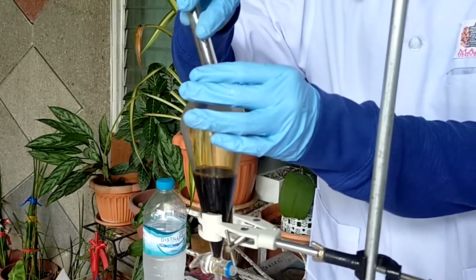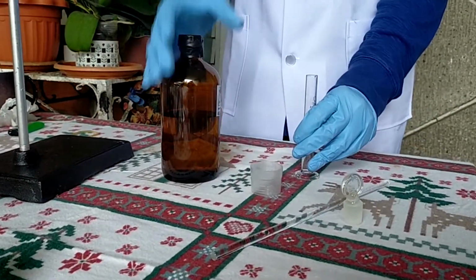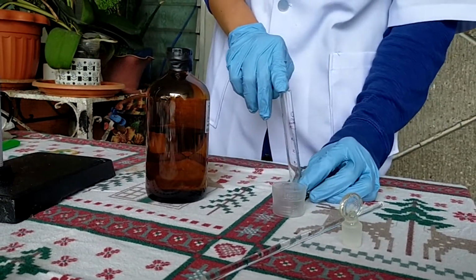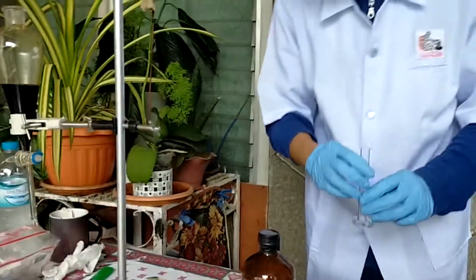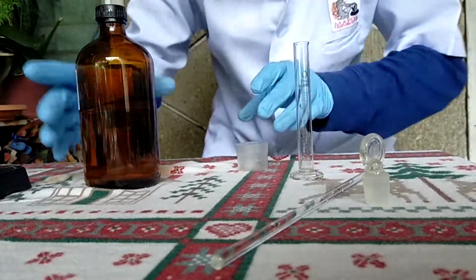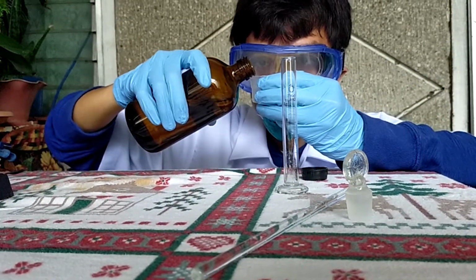Now that I have my coffee, I will now prepare my ethyl acetate. Okay, so now we will introduce our organic solvent. I will be using ethyl acetate, and I will be using this measuring cup. I will then put the ethyl acetate that I measured here, and to verify if it is indeed 10 mils, I will put it here. Okay, let's do that. Now I'm using a 10 ml graduated cylinder, and I'm using 10 ml because I'm going to extract this using a 10 milliliter graduated cylinder 10 times, so that it will equal 100 milliliters of organic solvent.